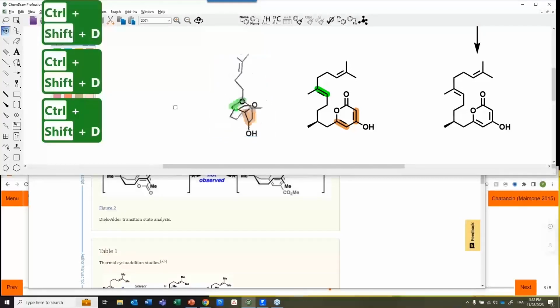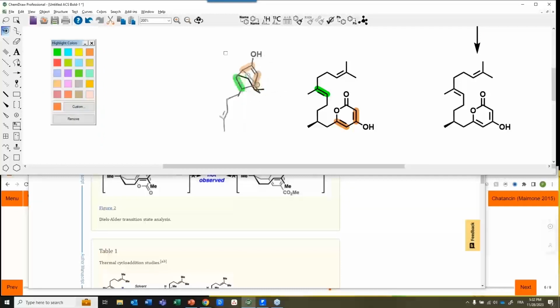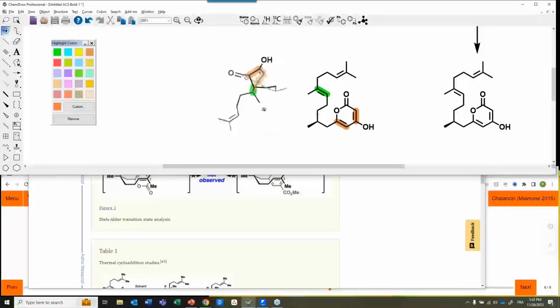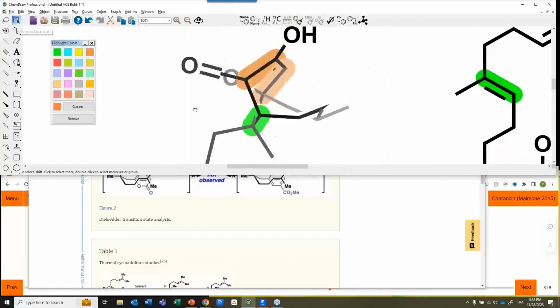Okay, so a couple of things can happen here. In the paper, we're trying to achieve a chair, a 6-membered ring here. And the 3D cleanup is not necessarily going to give you the chair conformation that you want from the get-go. There's a little bit of nudging that you will need to do to get to a chair conformation.